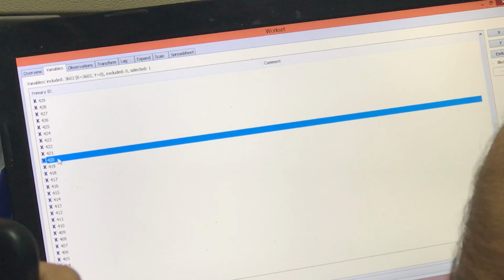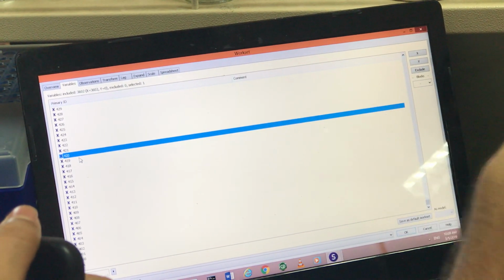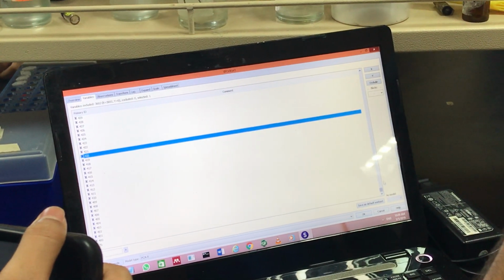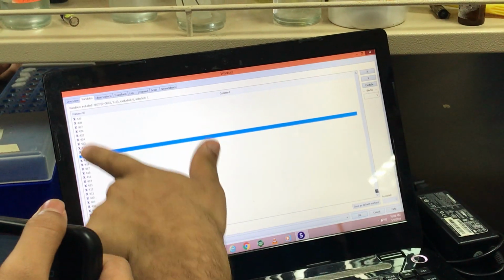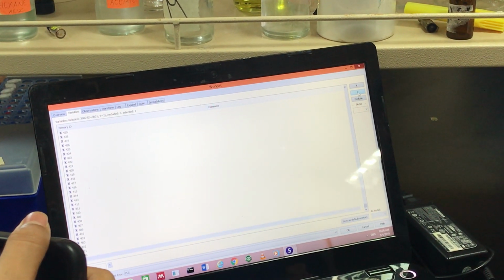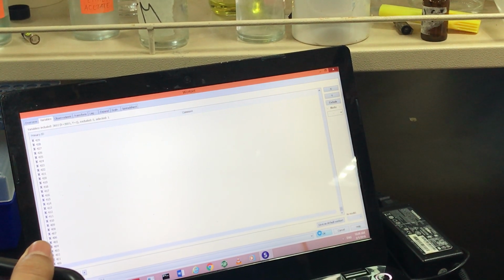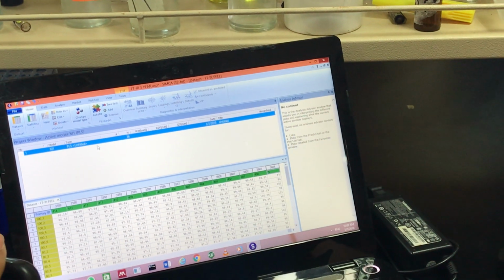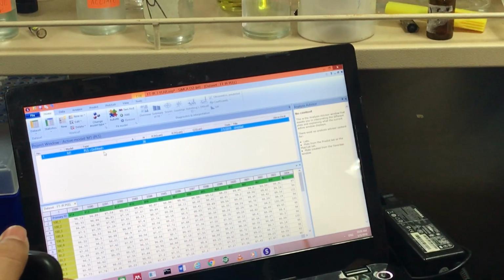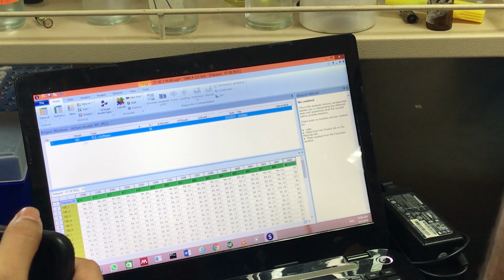Okay, X and Y. You can see here the software gives all X. This one, this is the inhibition. I will change it to Y. Then okay. Y. Yeah, because in the beginning the data will be all X, or the variables X.